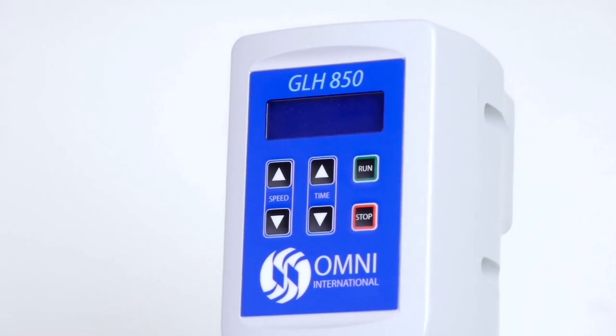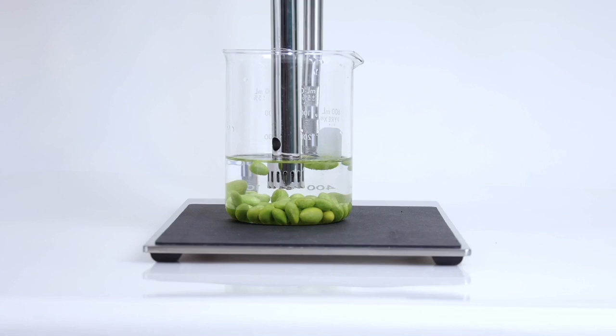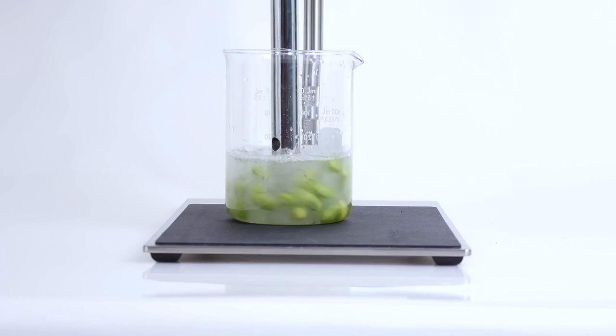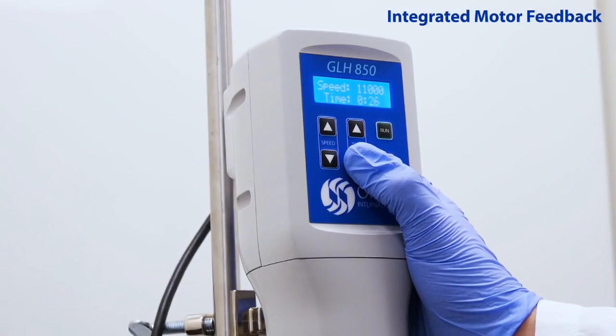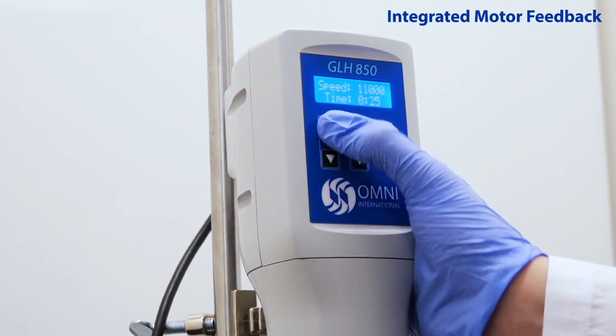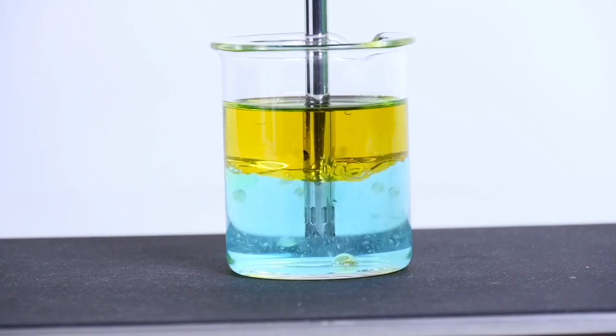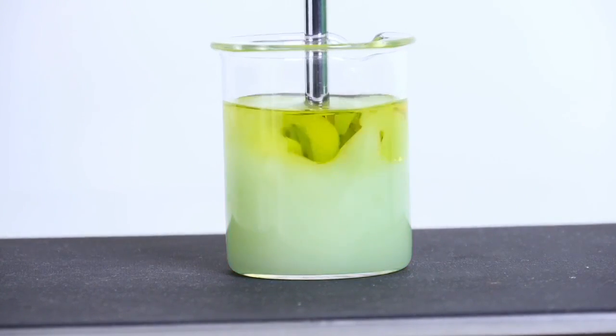The GLH 850's robust processing ensures complete homogenates and uniform particle size distributions. The integrated motor feedback holds set speeds during homogenization to ensure repeatable results regardless of any fluctuations in sample viscosity.